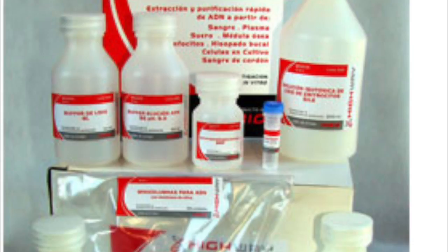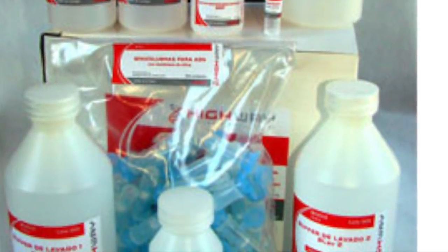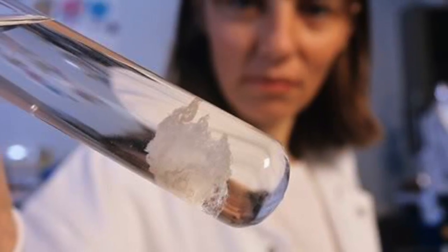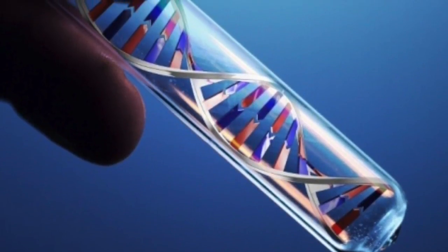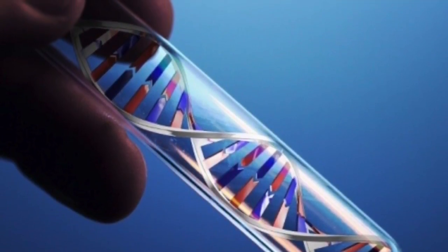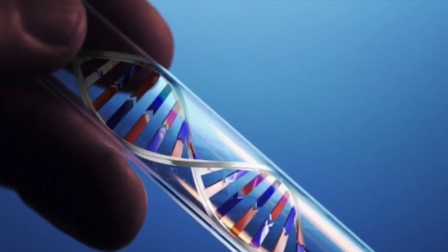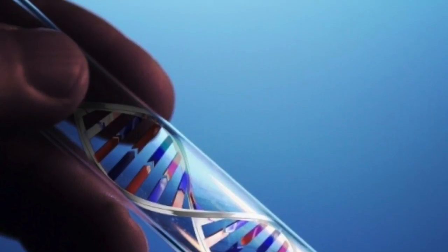This result suggests that the use of different elements in a determined pattern is useful for an accurate extraction of DNA of a specific human blood sample. It reveals the relevant use of saline as a solution to wash cells, the detergent as an element for the outbreak of cells, the enzyme as an effective component for the degradation of proteins, the salt and the centrifugation as fundamental for the precipitation of the materials of blood, the temperature as a catalyst to accelerate the reaction between two solutions, and the absolute alcohol as a useful tool for the complete exposure of DNA. So, the function of each element in a rigorous procedure allowed a pure DNA extraction.